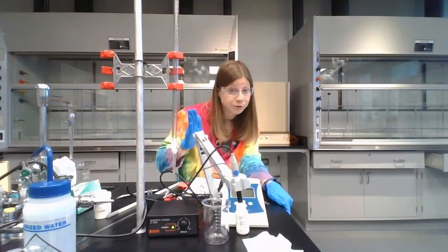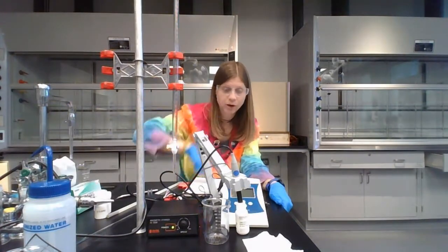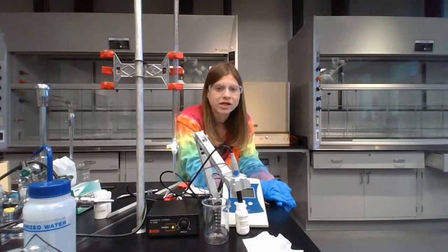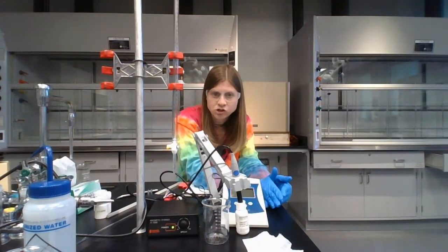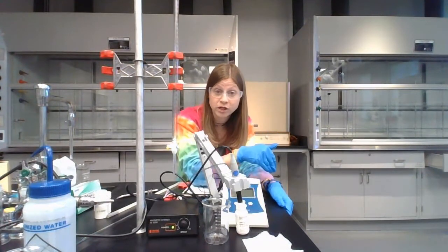So in trial 2, you're starting over, filling it up to the top, and doing 1 milliliter, write it down, 2 milliliters, write it down, 3 milliliters, write it down, and continue until you get close to where your big jump happened. We're really interested. We want to know where exactly that big jump occurred. So I'm pretending again that my big jump happened between 21 and 22 milliliters.